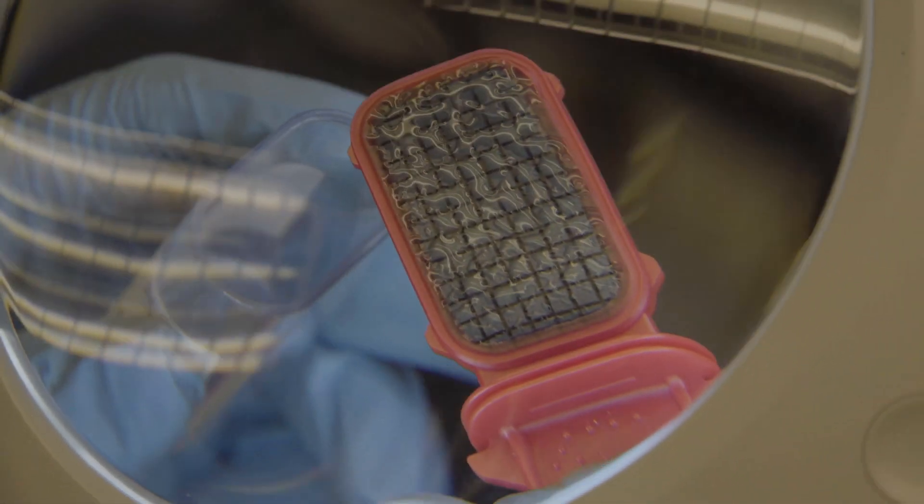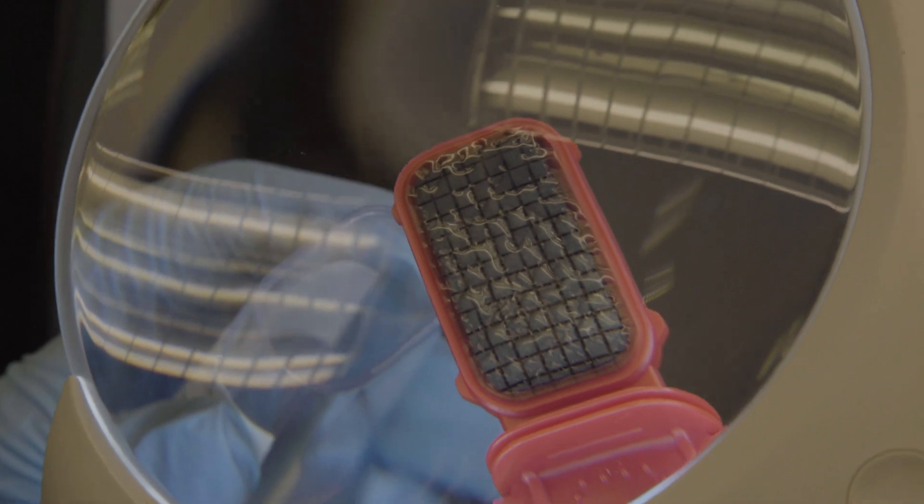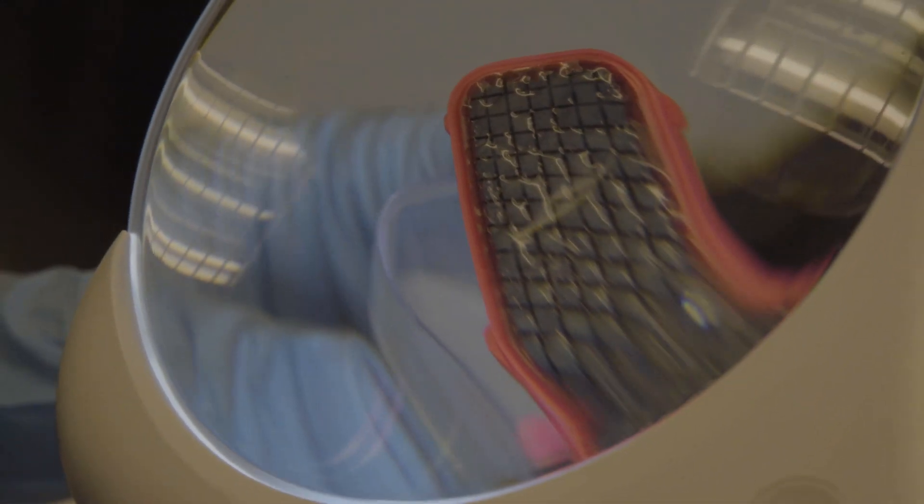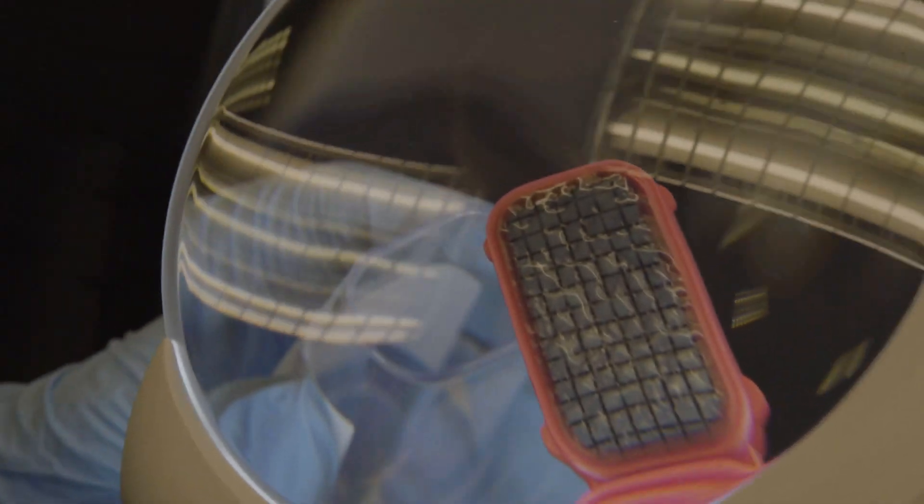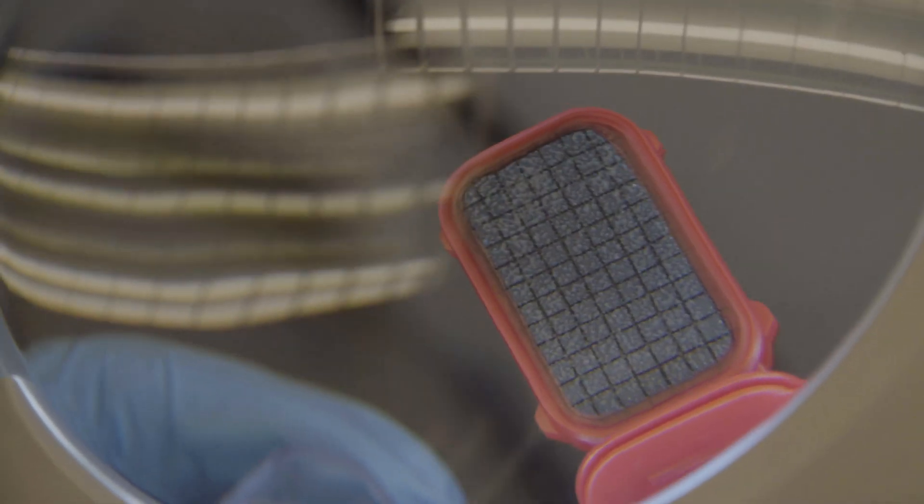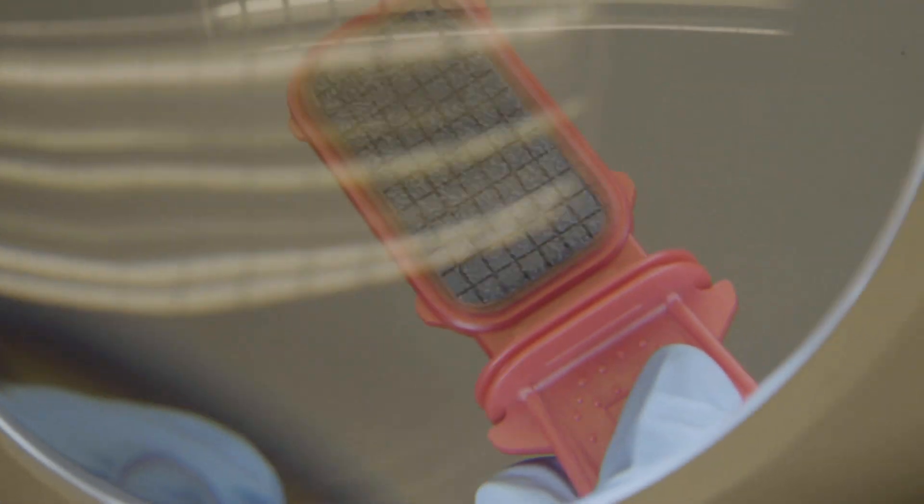Using magnification and viewing from an angle can help differentiate. You can use a blunt instrument to wipe across part of the surface of the sampler. If this clears an area with slime appearing on the instrument, then complete overgrowth should be suspected.